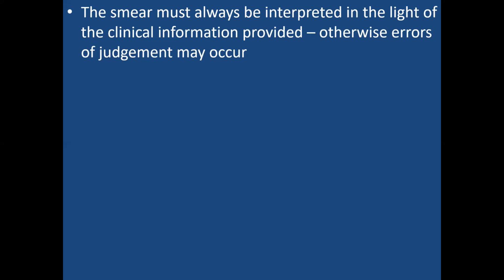But if the clinician includes the fact that the patient has been fitted with an intrauterine contraceptive device, then you are not likely to bother yourself with this. This is just one of many examples. It should tell you that interpretation of whatever you see must be done in light of the clinical information provided. You don't just ignore the request card, look at your smear, and write your report from what you are seeing without considering the clinical history provided on the request card. If you do so, there's going to be what?